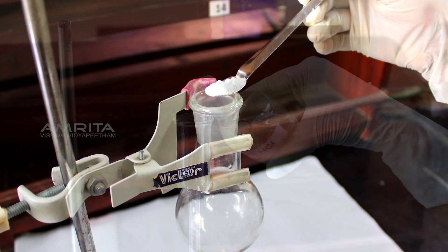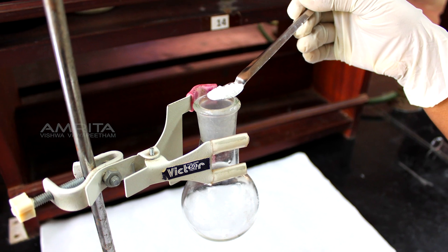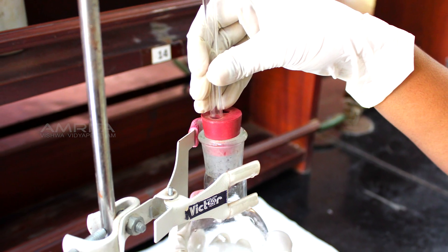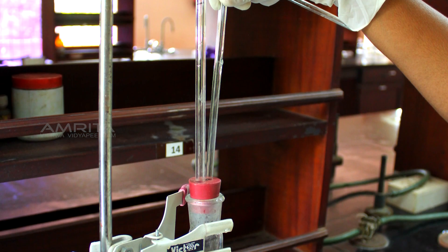Add HCl to sodium carbonate only after making the apparatus airtight, otherwise the gas evolved in the reaction will escape through the gap. Handle the chemicals HCl and NaOH carefully as they are harmful.